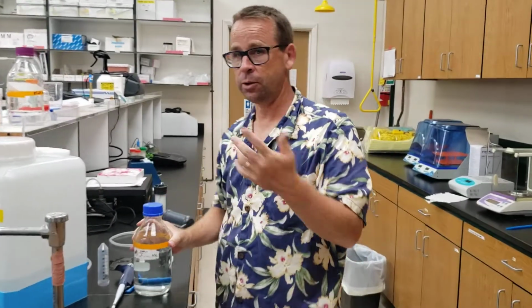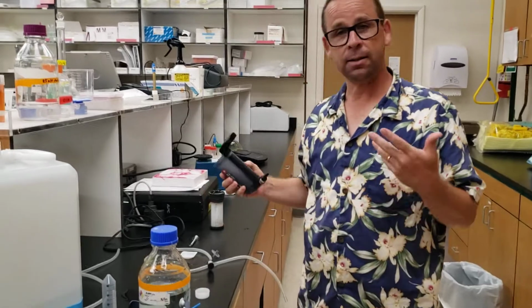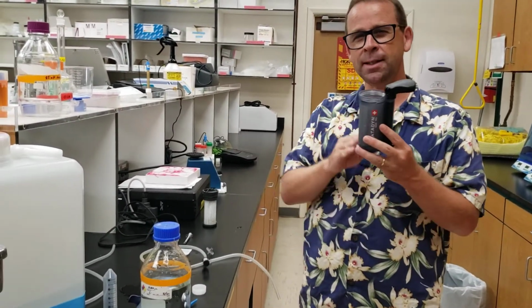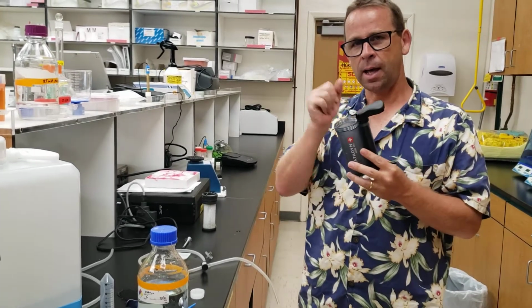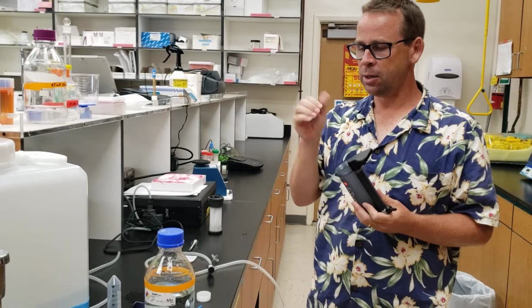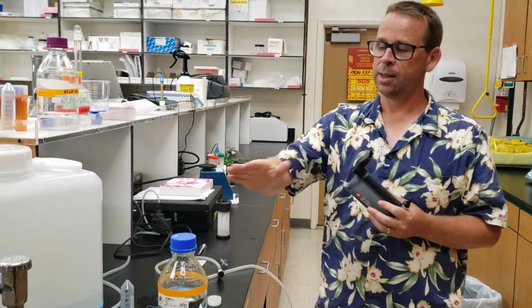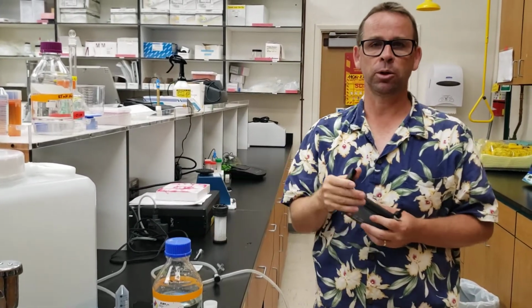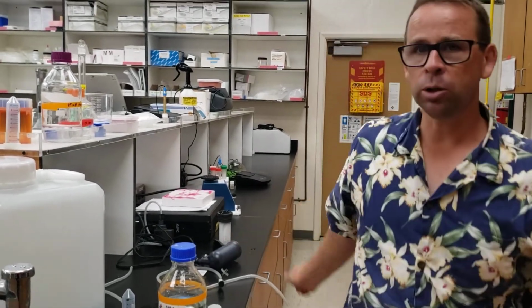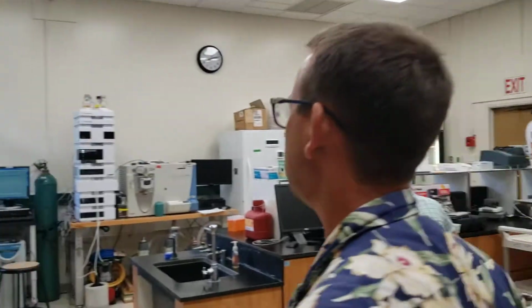Last time we tried to filter this through this pump, and it didn't seem to absorb anything. This time, we pumped some EDTA through this and let it soak on there for about 10 minutes, and then rinsed it with water, and then put 2.5 millimolar copper sulfate on there. And we can go look and see the results of that over here.